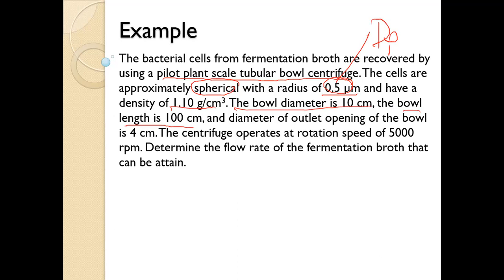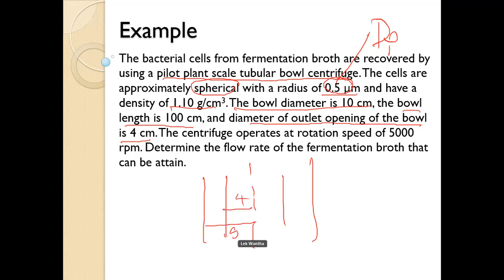The diameter of the outer opening of the bowl is 4 centimeters. This is the center. This is 4, this is 5. This is the liquid surface, and this is the wall of the bowl. It is 10 centimeters in diameter, or 5 in radius.